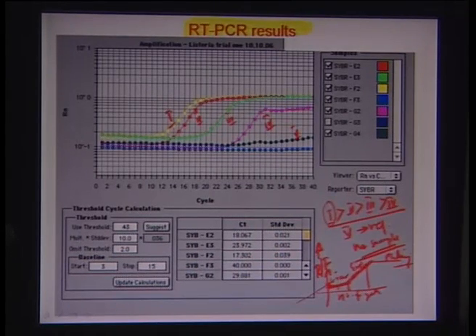Molecules are almost all the way around the reaction, and you have started to replicate at a very fast rate. After you reach a certain cycle here, there is a plateauing phase, which means one or more of the reactants are depleting, and because of their concentration depletion, there is a gradual reduction in the growth rate of the fluorescence. So that's why this particular trend is visible.